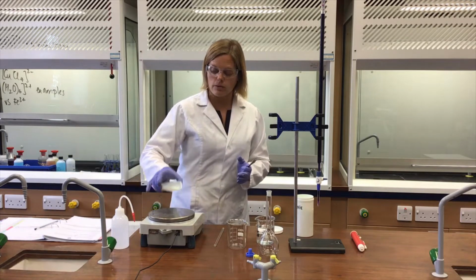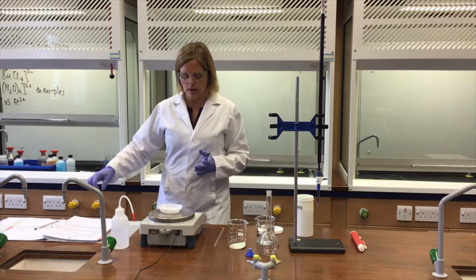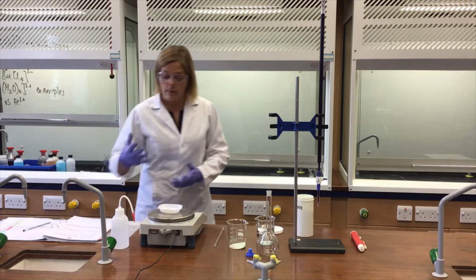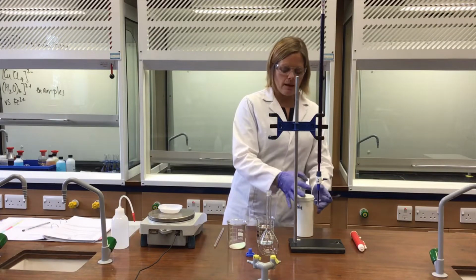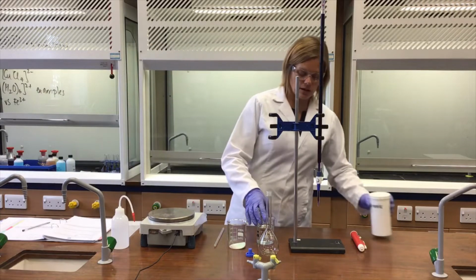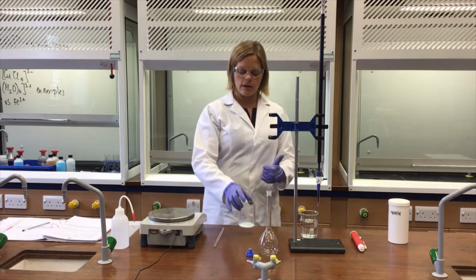Then take that weighing boat, pour that solid straight into a clean and dry beaker, and then reweigh the weighing boat in case there's any residue stuck to that. And that mass is 2.76 grams, so 2.76 plus or minus 0.01 grams. So now I can calculate accurately the mass of the solid which was transferred to the beaker. Now it's important to remember that the aim of a standard solution is that we need to know its concentration incredibly accurately. So every last tiny little bit of that solid that's ended up in the beaker here has to get transferred into the flask over there.